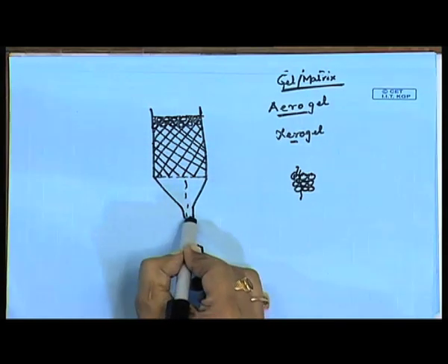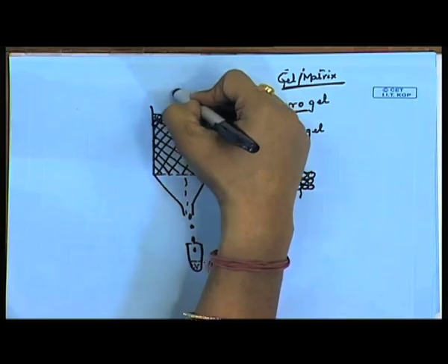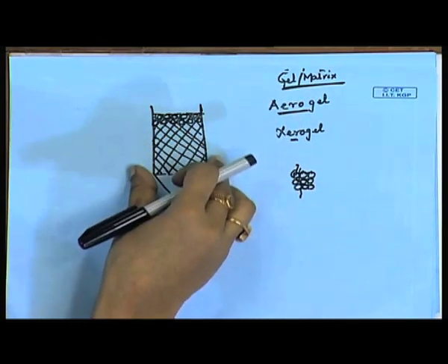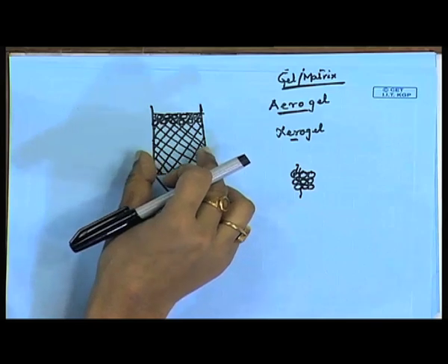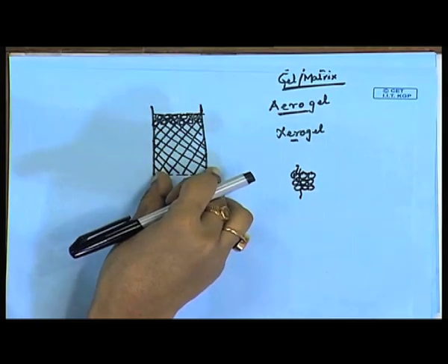In that case we can pass the proteinaceous molecule from the bottom of this column, and we can take the fractions from the top to avoid the gravitational force. So, it can also be done, and this process can be done continuously till the fractions are coming.